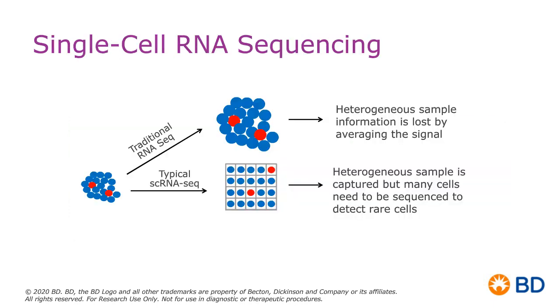So when we think about when we want to do single-cell RNA sequencing, well, before we really had true single-cell RNA sequencing, I am an individual who has done this top line here, where we would do traditional RNA-seq. For example, I would look at a knockout mouse, and I would look at an infectious disease in that mouse and compare it to a wild-type animal. And then I would say, well, I want to look at the immune response in the spleen. And then maybe I was saying, well, I specifically want to look at a certain cell population called natural killer T cells.